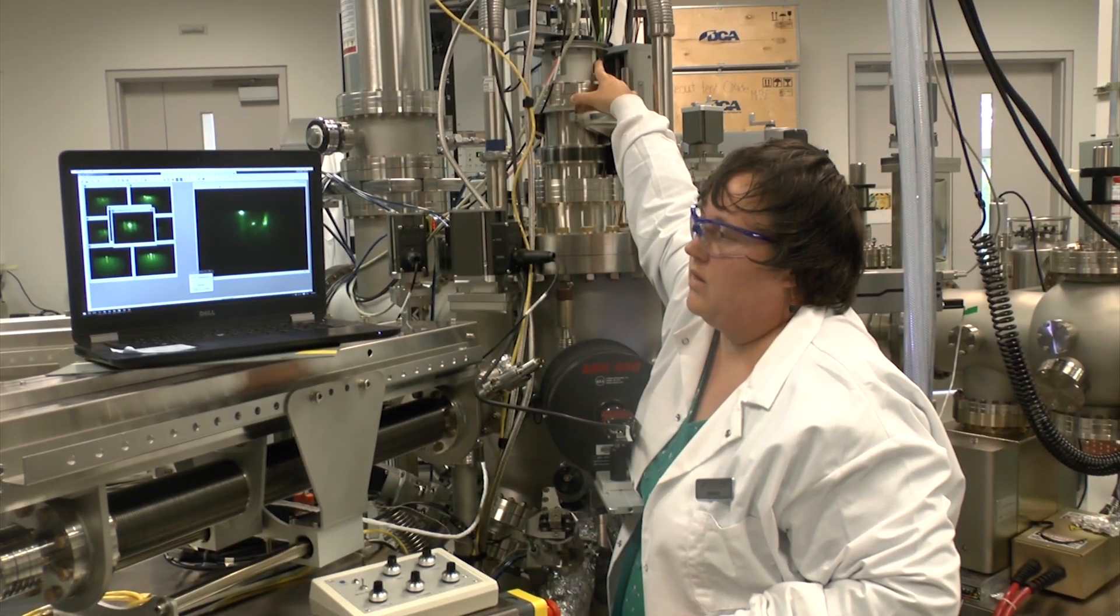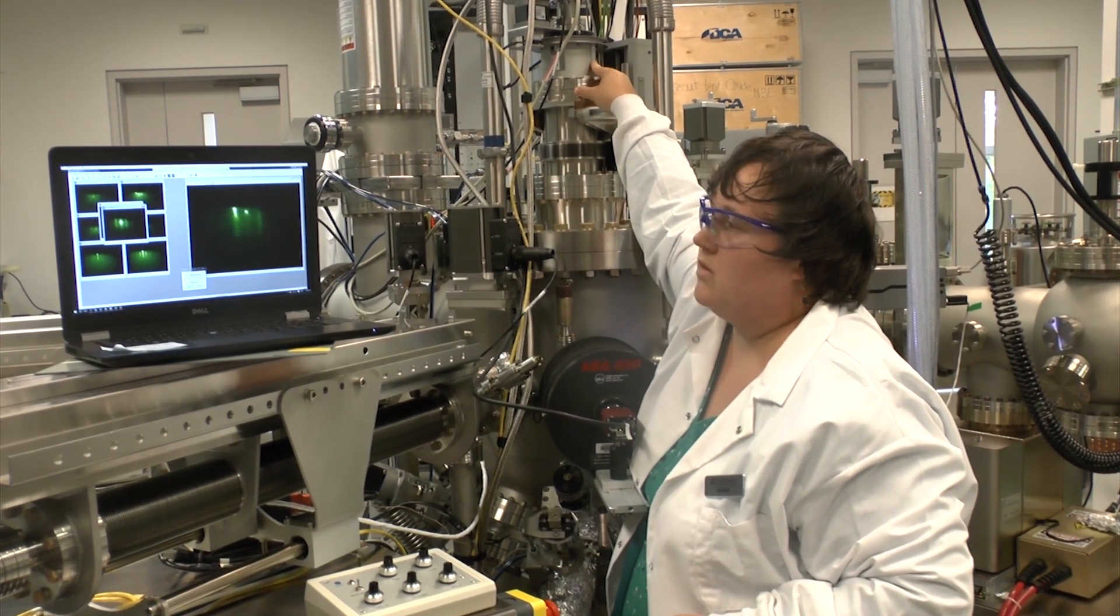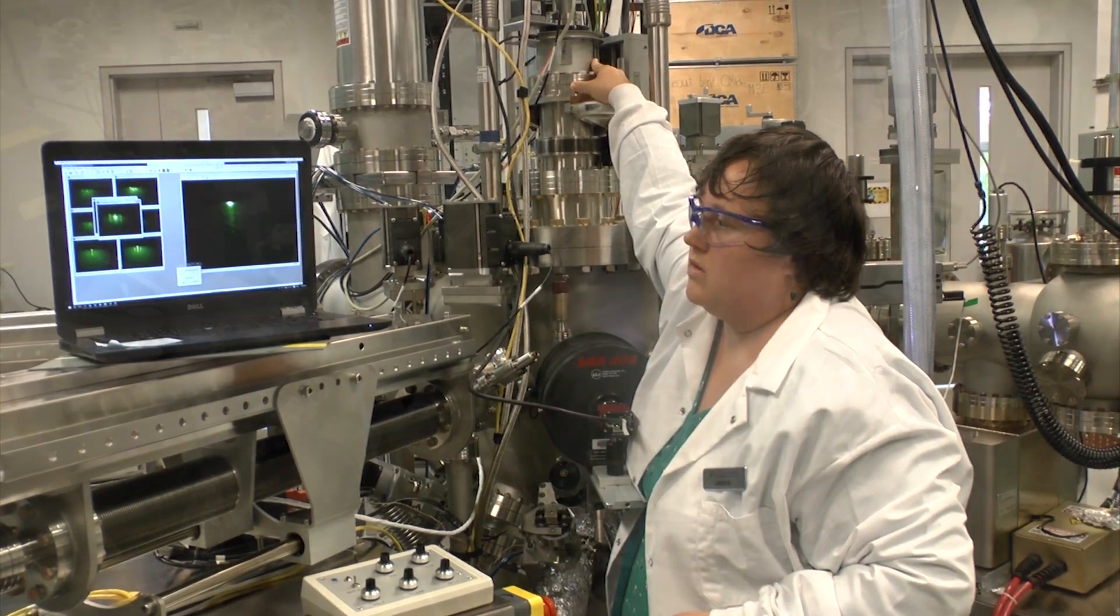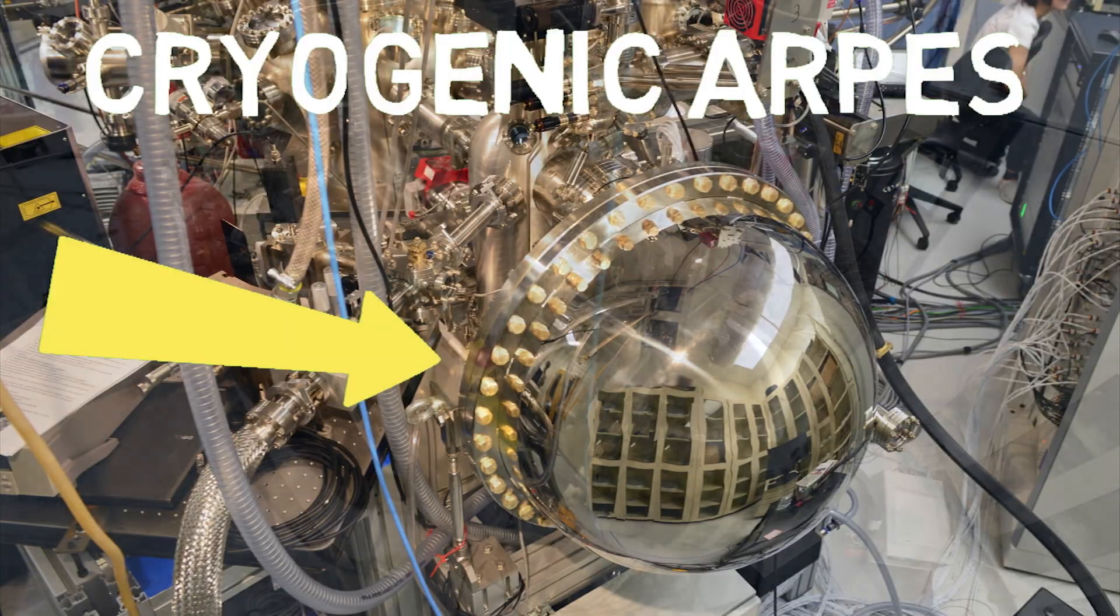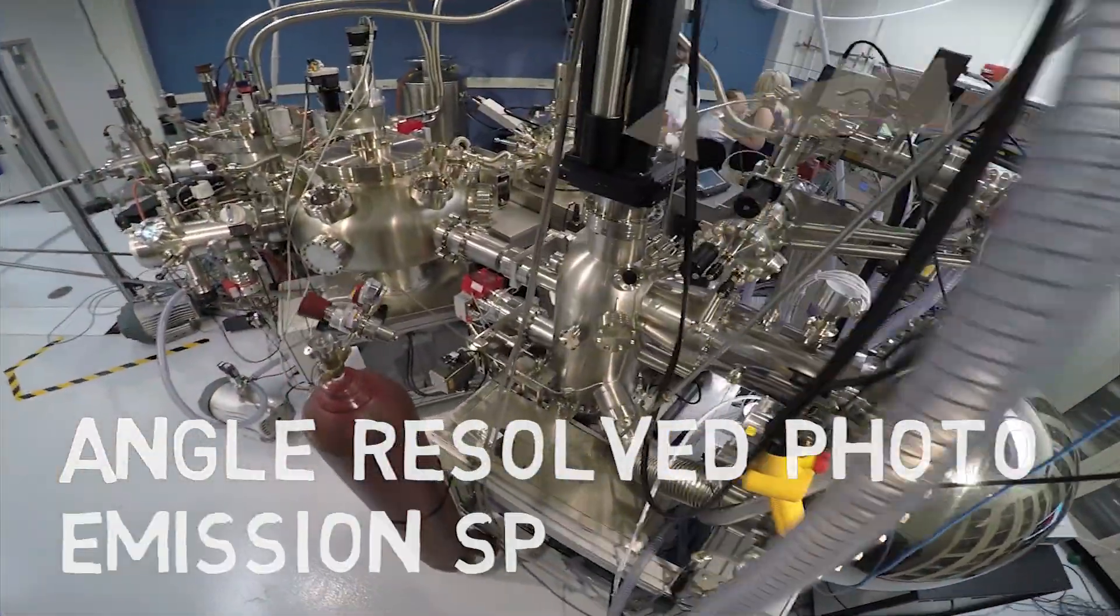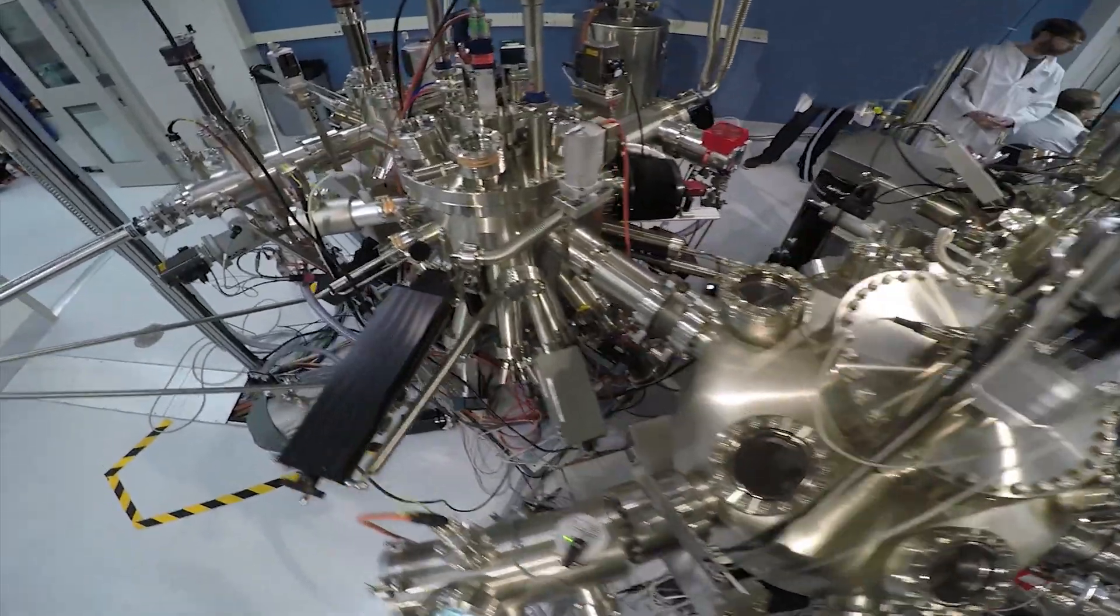During growth, we can observe and characterize the sample using optical and electron diffraction techniques and alter the experiment in real-time, if needed. The ARPES allows us to measure the electrical properties of an ultra-thin film at various stages of its growth. The STM chamber gives us a unique image of the atoms that comprise the layer surface.